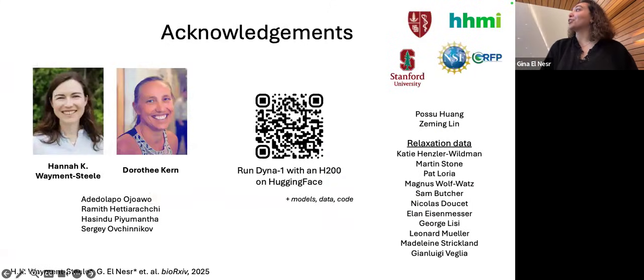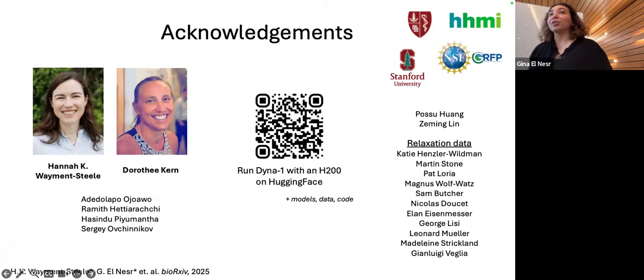Yeah, and so this is a great project with Hannah and Doro. We're really excited. Everything is up on Hugging Face, the data, the code. And because it was built on ESM3, previously it was a more restrictive license, but they recently announced that they were going to be open sourcing everything. And so Dyna 1 will also be completely open source for commercial purposes too. And so we're really excited for that. There's a Hugging Face for Dyna 1. It runs on H200, so it's super, super fast. You just drag and drop. And so it's super intuitive and easy to use.